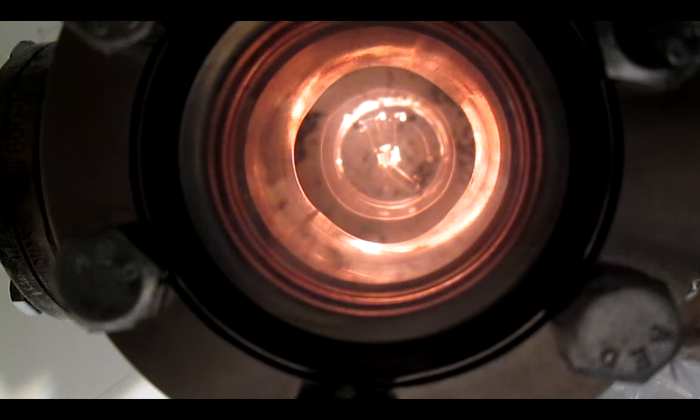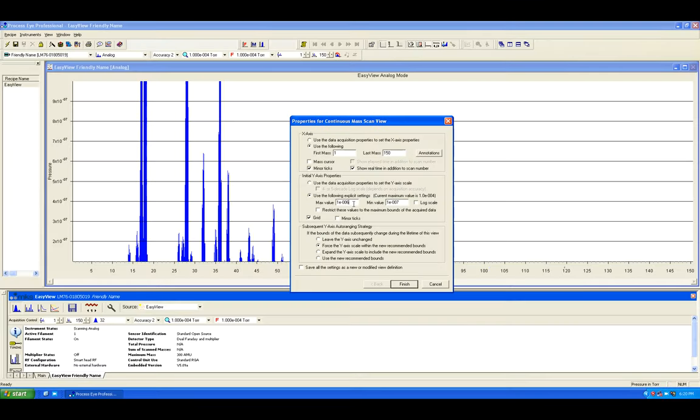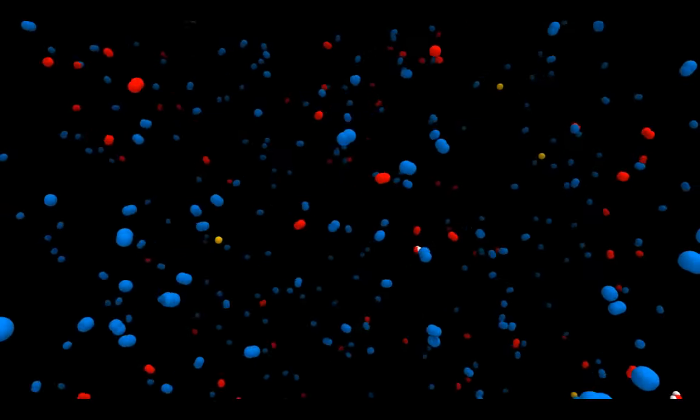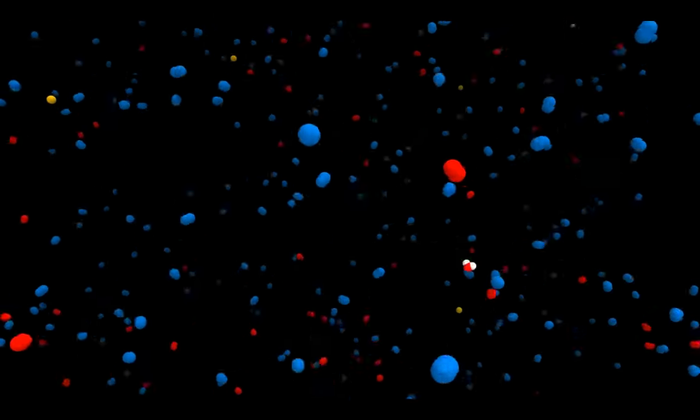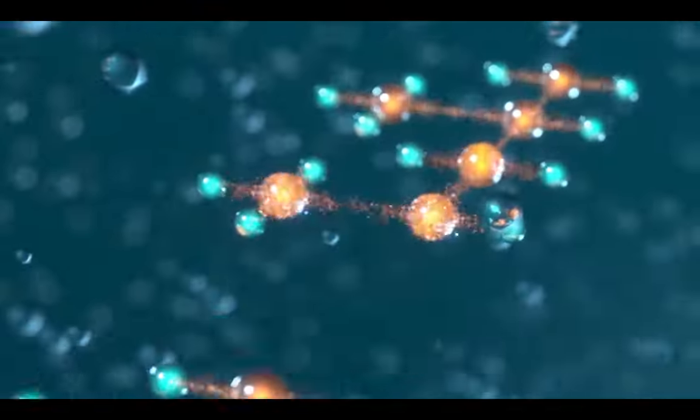The electrons are accelerated by the bias high voltage, also controllable. Whatever stands in the way of this electron tsunami gets ionized, split, ripped, thrown apart, or all of the above.